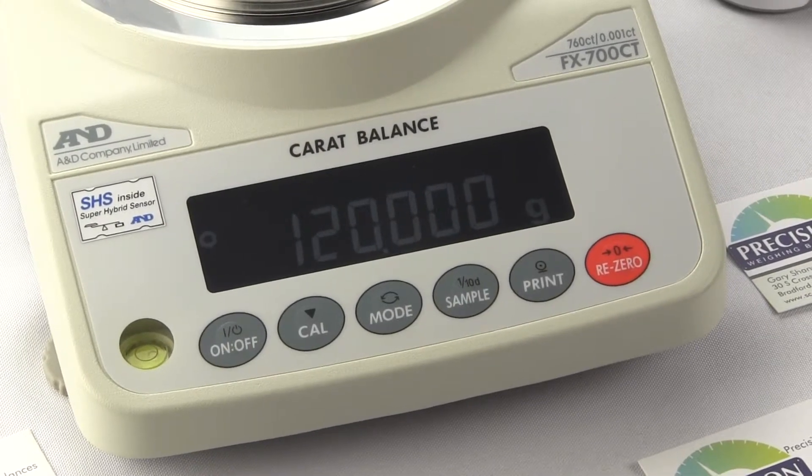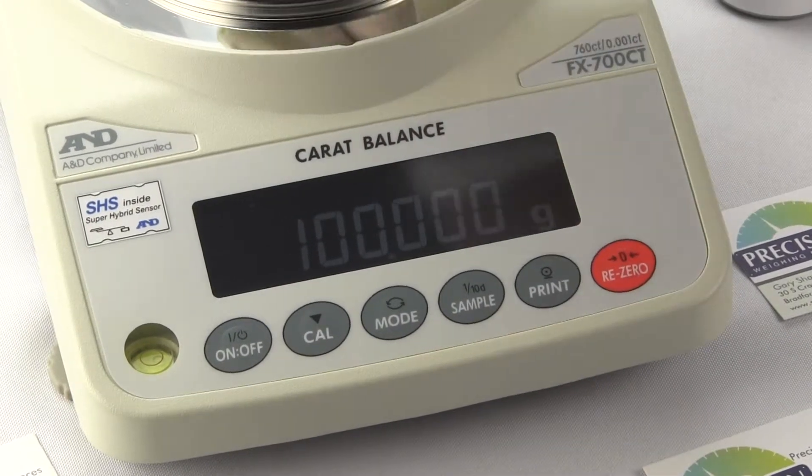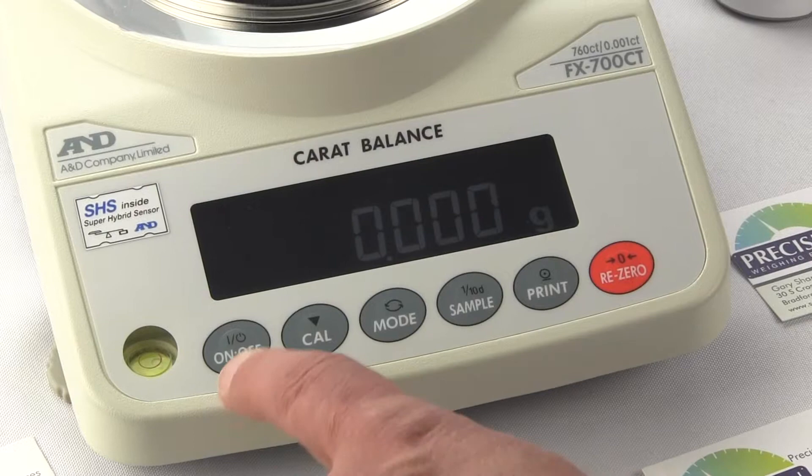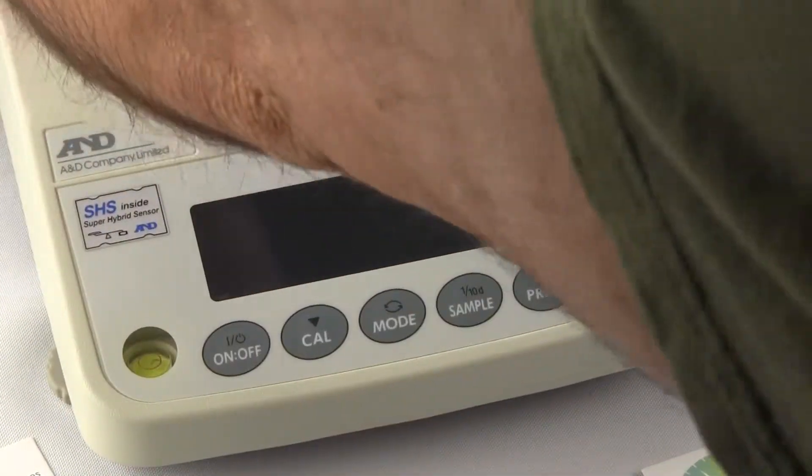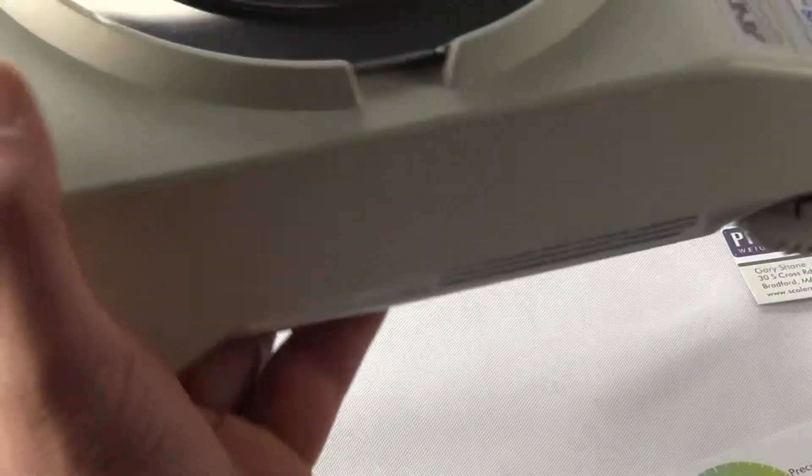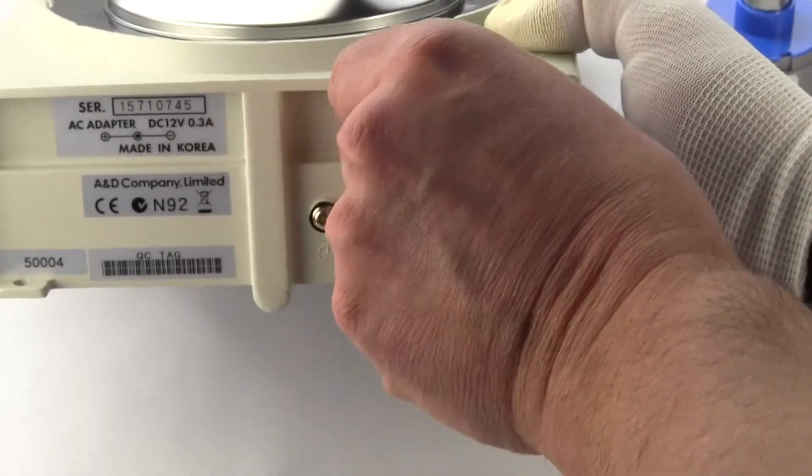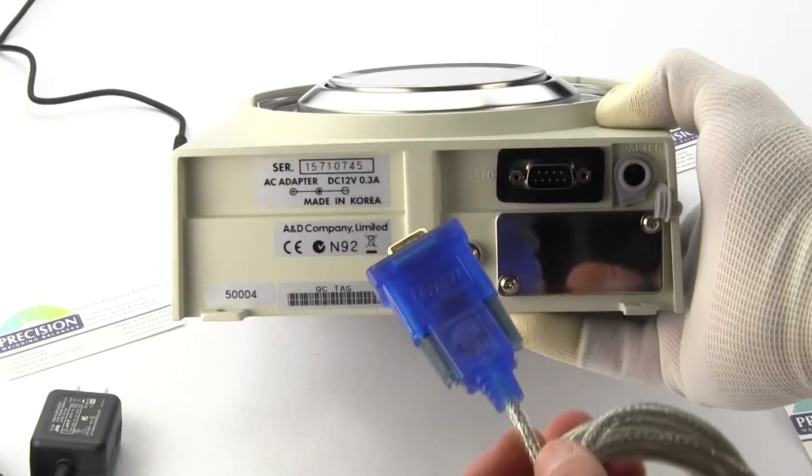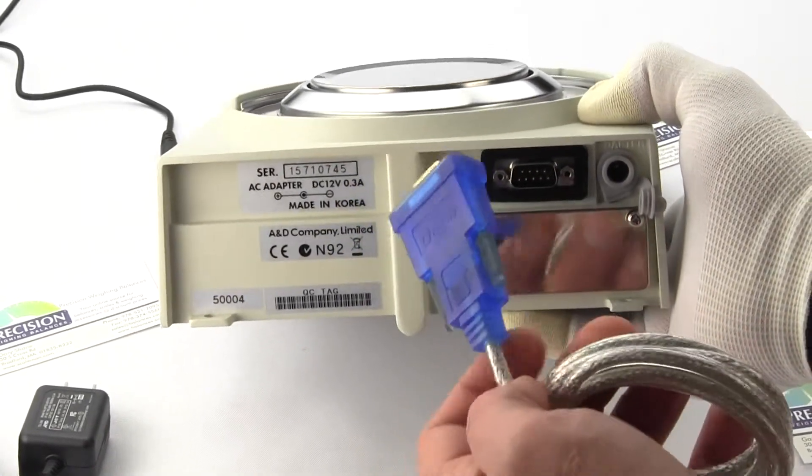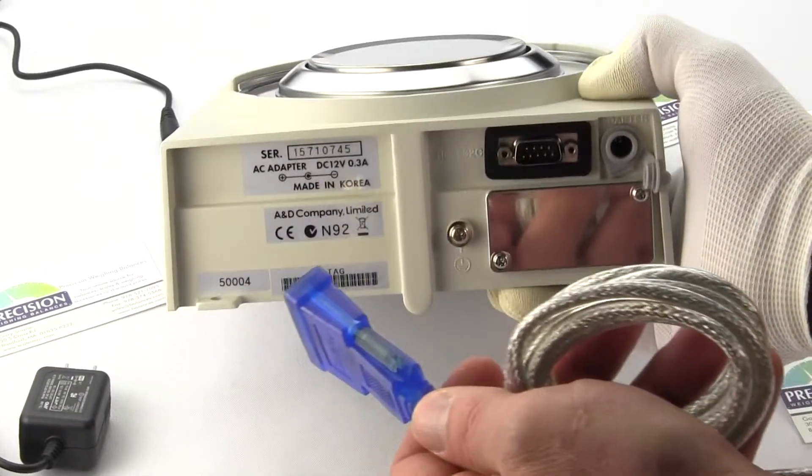One thing that you'll notice about this balance is it has also an RS-232 on the back. So let's just shut off the balance for a minute and try to show you some of the features on the rear of the balance. This balance again is operated off of AC adapter only. On the rear of the balance we have an RS-232 interface. This is a serial interface. We do offer an optional RS-232 to USB so this would just plug right in. You would need to load a driver but then you have a USB interface.